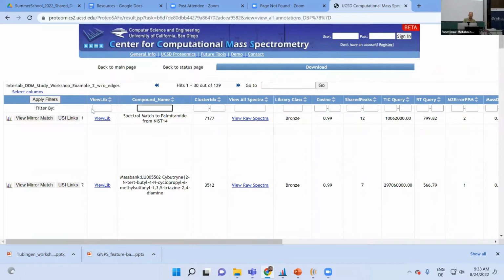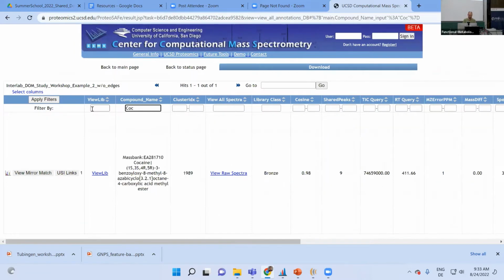But yeah, okay, let's see if I have cocaine too. Oh yeah, cool, nice, thanks. Thank you, Mass Bank. I got a very nice hit. So now, yeah, to think already a little bit about confidence, whether I believe this or not. Hearing from you guys that you found it too definitely adds some confidence here.